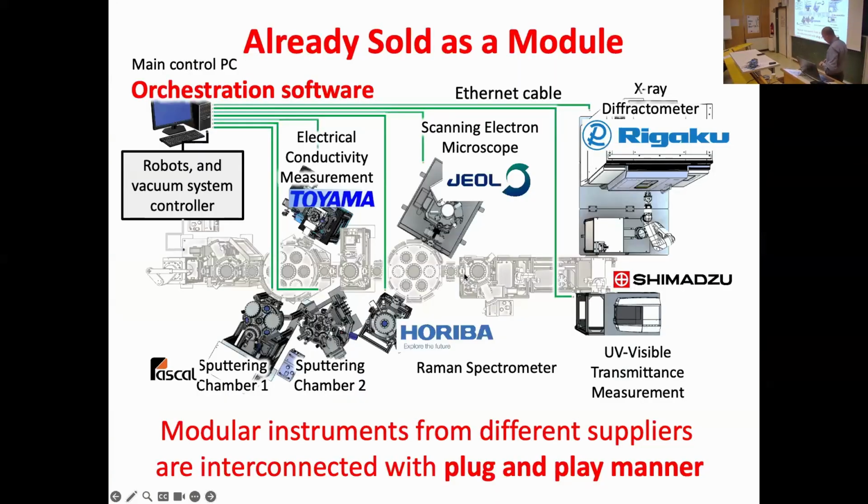And then we utilize all these systems, and one important thing is that these are modularized. This is an important part. This system is custom made, so it's very expensive, but this is the direction everybody is going. Try to make the system as modular as possible, and then you can buy each module, bring it into the lab and just connect it. And then all autonomous. And then we need flexibility. Research always changes.